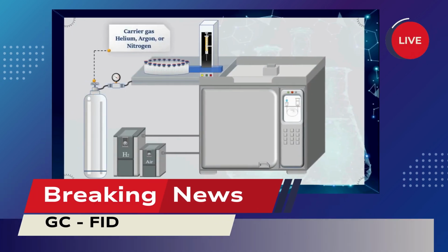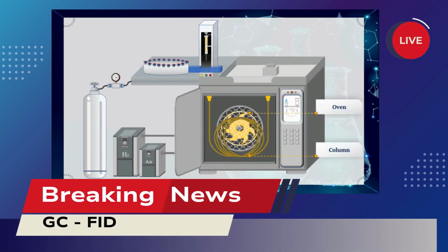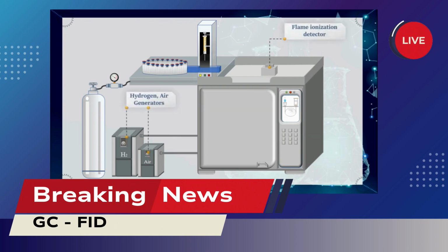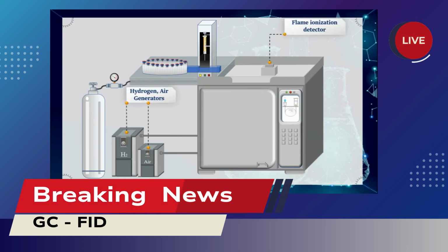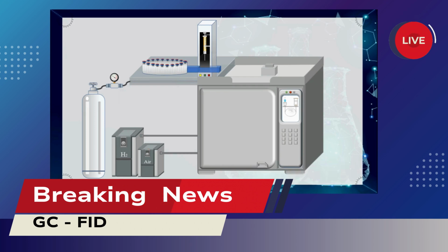A typical GC system has three key components. First, the mobile phase. This is a carrier gas, often helium, nitrogen, or argon, that transports the sample through the system. Second, the stationary phase, a column located in a temperature-controlled oven where the separation of compounds occurs. Third, the detector. Devices like the flame ionization detector, FID, measure analytes in the gas stream.